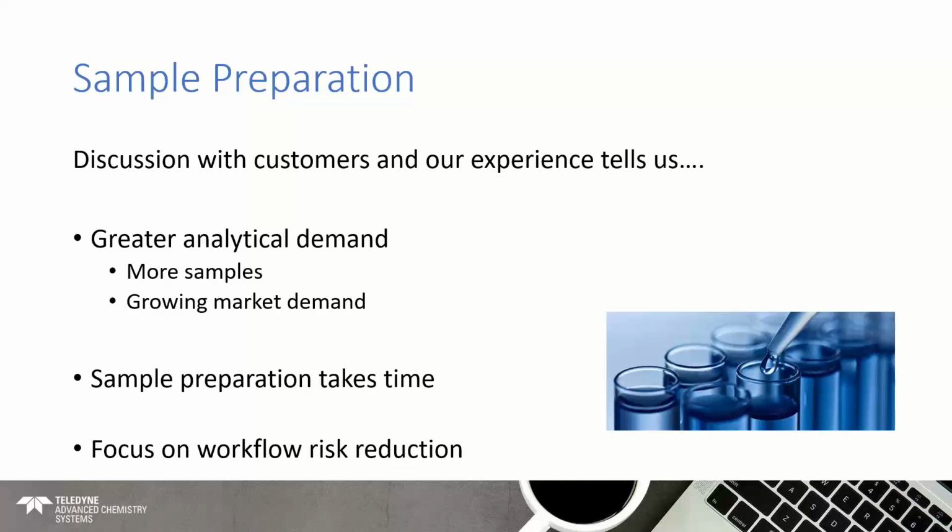And when it comes to reanalyzing samples, it's not as simple as just reanalyzing one, because you never just reanalyze one sample. You reanalyze that one sample, but also with the calibration standards, the blanks, the QCs, etc. So it's not just as simple as doing a reanalysis. It's much more than that in terms of planning for your analysis. So risk reduction, that's another thing that we're hearing from a lot of people at the moment.